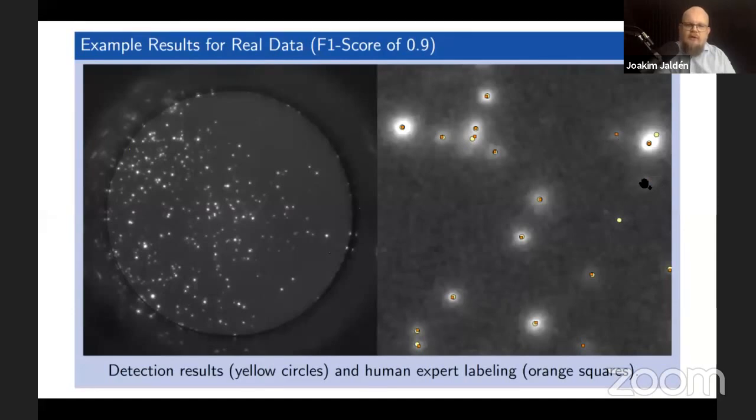But then you should know that this threshold here is set on a global level on this picture, right? So there's probably a consideration somewhere else to decide how weak the spots can be before they are included. And possibly this spot could also be due to a broken pixel or something like that. But overall, it's a fairly accurate result for this type of picture.